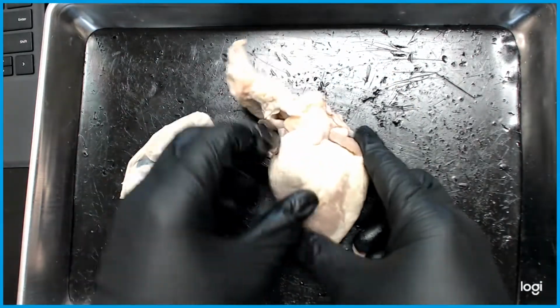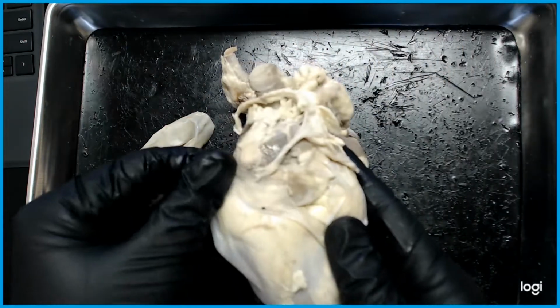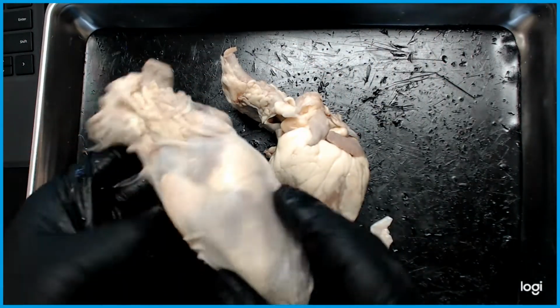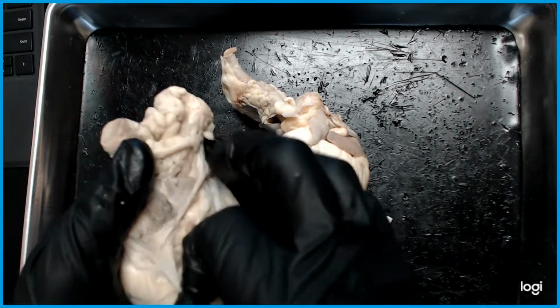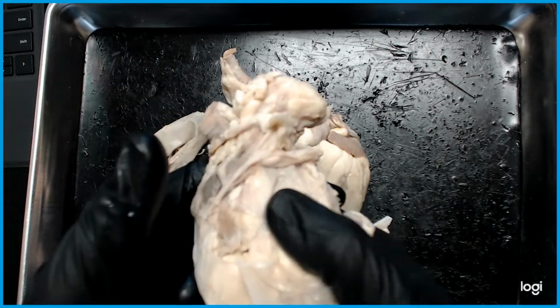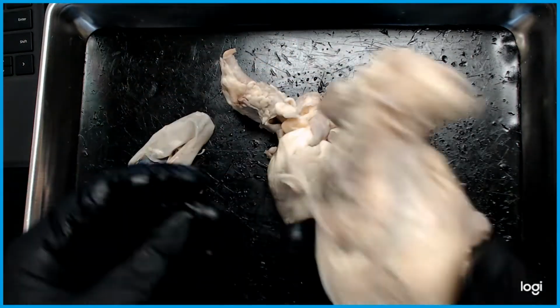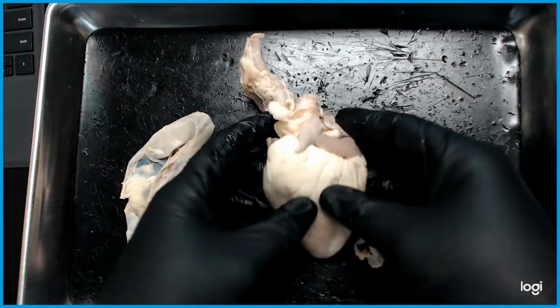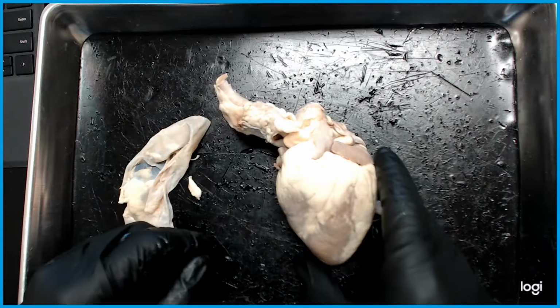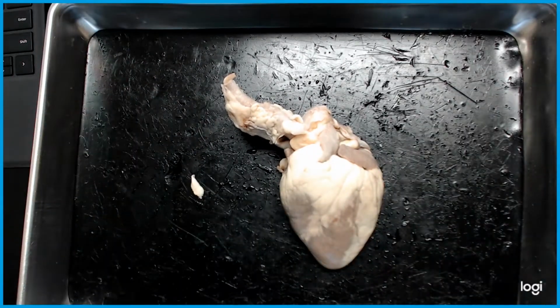Some of your hearts might be a little bit differently shaped. In the case of this one, it's a little pointier, so the apex is a lot pointier, maybe thinner, and that plays a big difference when you're trying to identify, as some will maybe be squished from shipping. Just find whatever works for you, that is in good shape, and that you can determine at least an anterior and posterior side. We can grab our tissues and get them out of the tray.